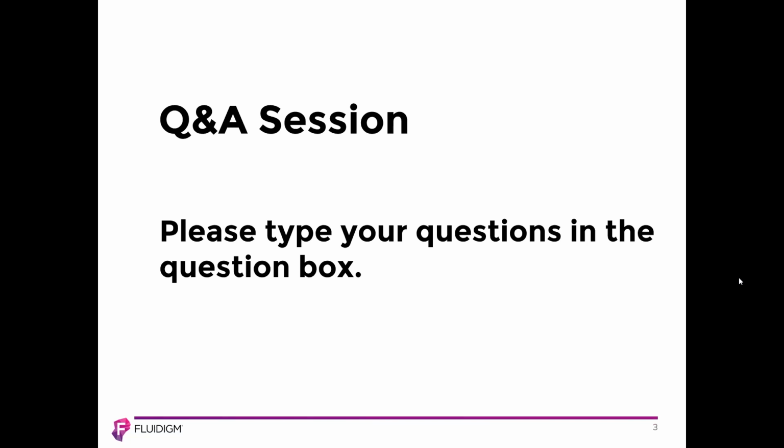We have protocols to help support you with it, so if you have any further questions, again, please reach out and we can help you every step of the way. We've done the protocol many times. It's actually quite simple. The second question is another one based on a comparison with immunofluorescence, and it says, what are the advantages of using imaging mass cytometry compared to a standard technique like IF?